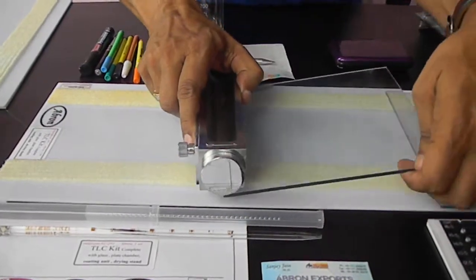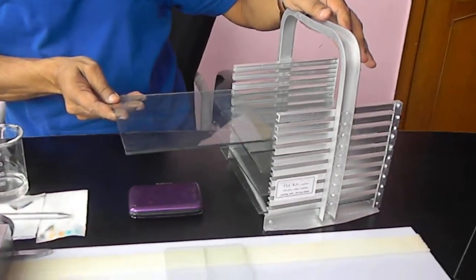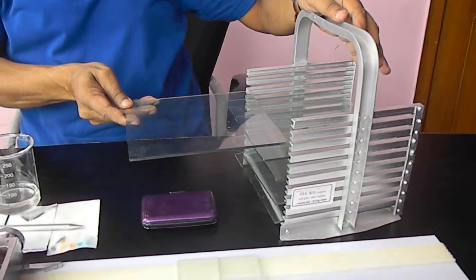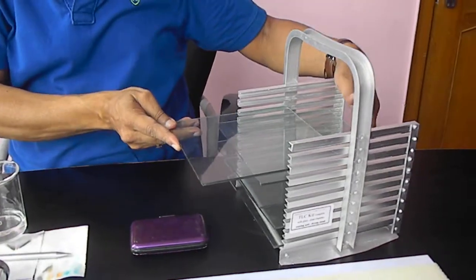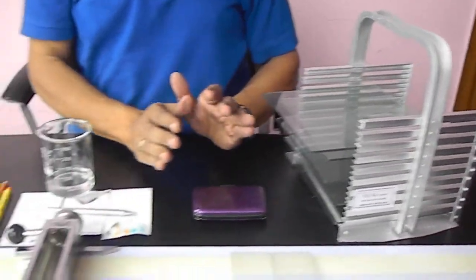After full coating, you can take it out and dry it in the chamber. This chamber you can place and then it can be put in the oven to dry, or air drying can be done. Now this is the first step, and then this is the development tank.